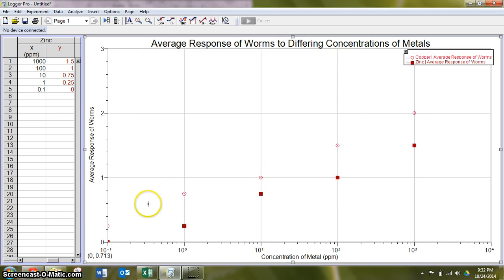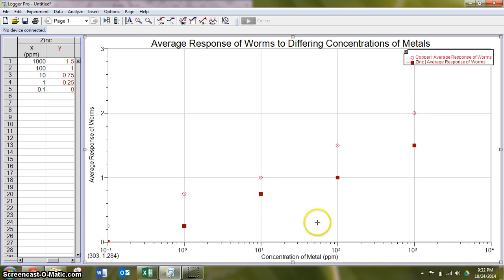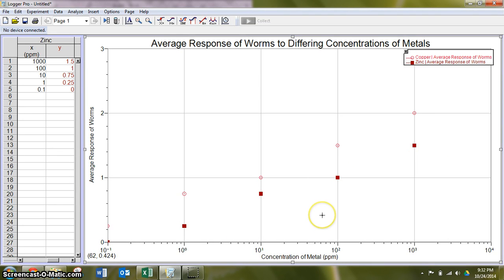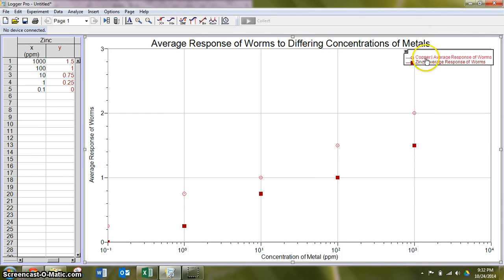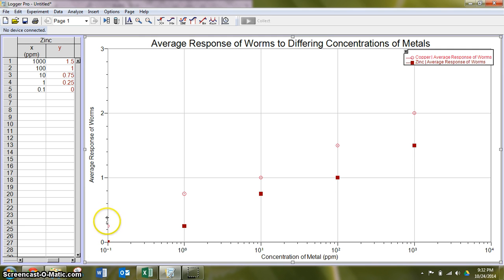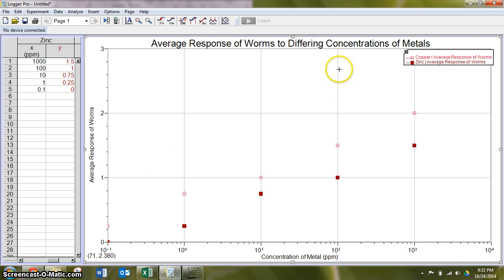So here we see a general typical trend in the same direction, but notice that the zinc is showing overall lower concentration results, lower responses to the same concentrations than the copper does in this case. So the data I was using was just data that I used to show you how to do this. Obviously, you guys should use your data that you personally came up with.